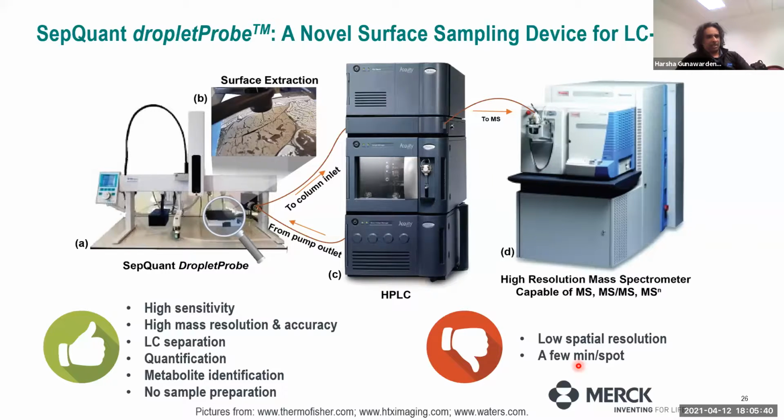I know you didn't show this, but what is the advantage of also doing nano-DESI? It's not as sensitive as MALDI imaging, and maybe has other problems in terms of spatial resolution as well. Nano-DESI is working with an academic collaborator on investigating new technologies and seeing what the advantages and disadvantages are. I'll stick to the advantages. We were able to identify, and I won't go into detail because we're publishing this now, some metabolites that are quite labile that we couldn't identify with other methods. We were imaging the kidney and other tissues, getting really good spatial distribution and seeing how different types of drug metabolites are distributed throughout different tissues and within the tissue. So there were some advantages there.